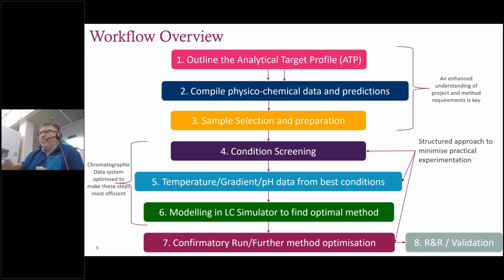And then the other thing that we looked at is how can we simplify what the operator or the scientist or the analyst needs to do at the instrument? Where can we take away some of that pain where there's a lot of effort going into writing methods for the instrument, for example, rather than actually spending time thinking about what experiments you actually need to run? So how can we make those steps most efficient?